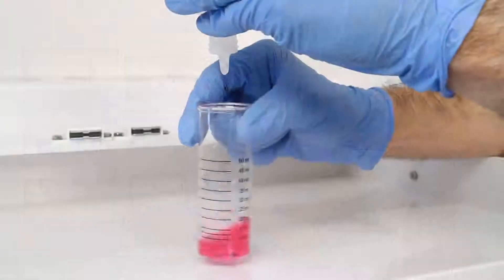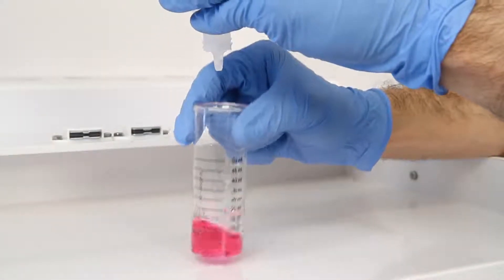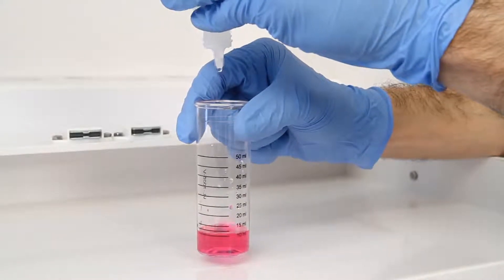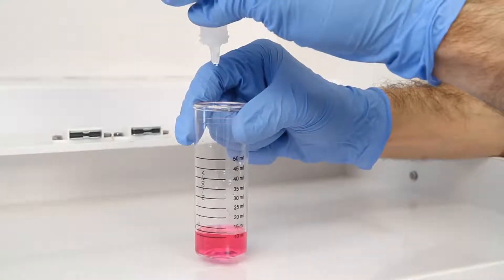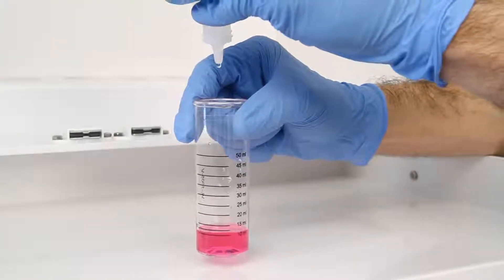The bottle contains a dropper tip, therefore it's important to hold the bottle vertically to get a consistent drop size. After the addition of each drop of titrant, swirl the vial to make sure the sample is properly mixed. Count the number of drops during this step.